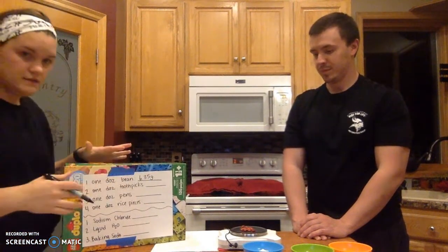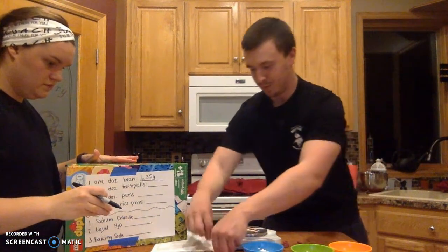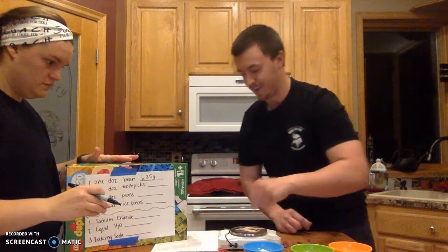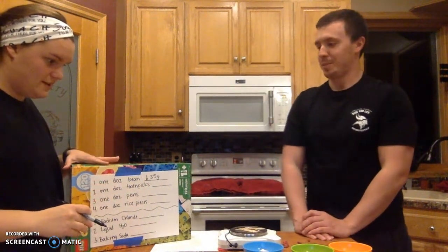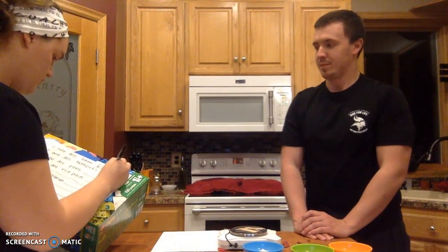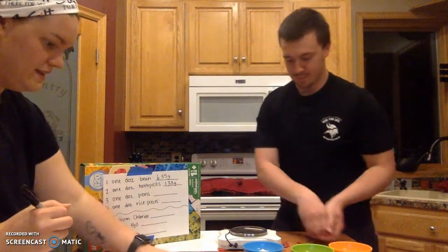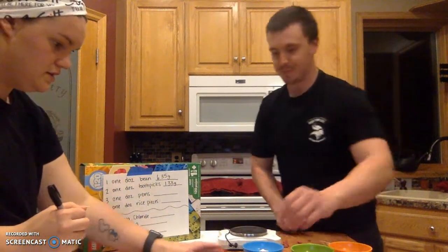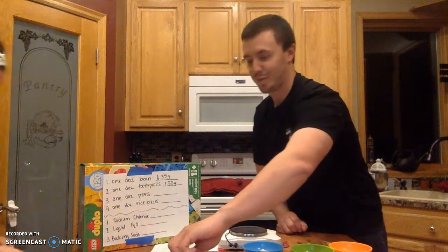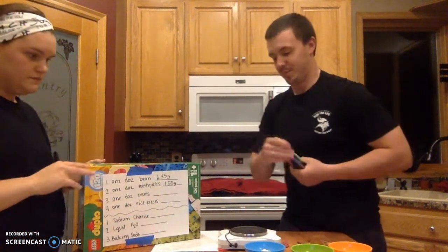6.35 grams. Okay, will you switch over to a dozen toothpicks then, please? A dozen toothpicks, 1.33 grams. Okay, switch over to the dozen pens. 11. Oh, where's my last pen? We're one shy. There you go, 12. A dozen pens.